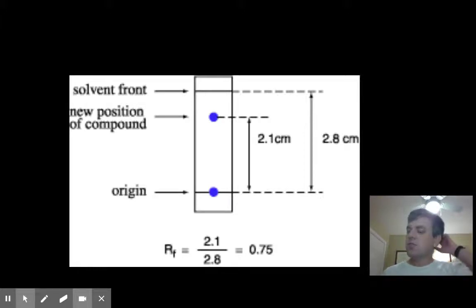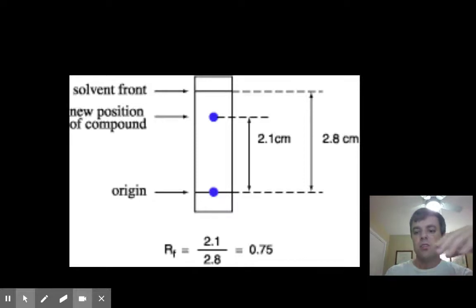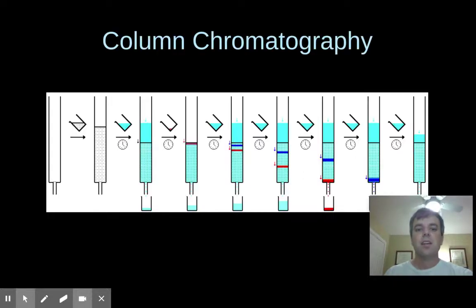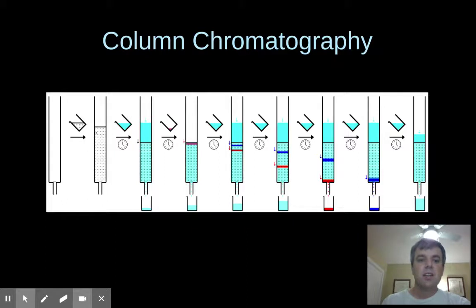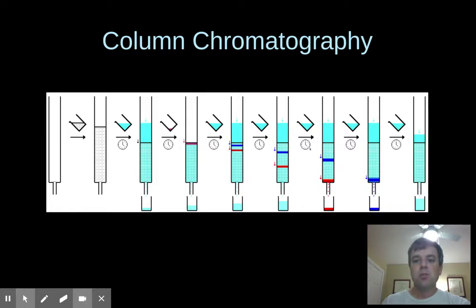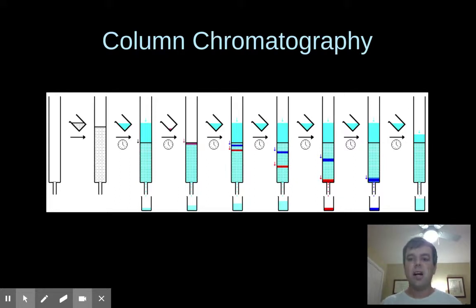You're not going to have to actually calculate the retention factors, but I want you to go through and look at the ones you had. I also want to show you some column chromatography. Here you have your column — you put your adsorbent material in there and pack it down with some water. Then you add your mixture of substances, like a red and a blue dye. The red dye will move through the fastest, then the blue dye comes through. You keep adding water or whatever solvent you're using to keep flushing material through the column. That shows how you can separate two different substances through column chromatography.